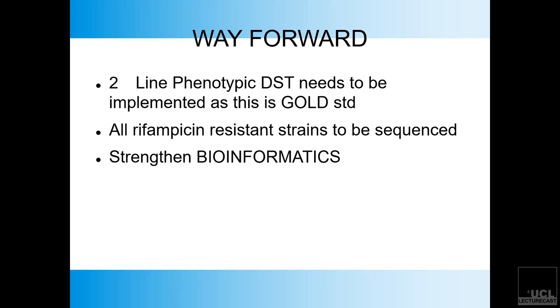Yes, even viruses. In fact, the rapid kit that we're going to be using, I used it for COVID. During the COVID outbreak, we had a study where we sequenced COVID isolates. I used the rapid barcoding kit for sequencing of the COVID isolates. Exactly, yeah.